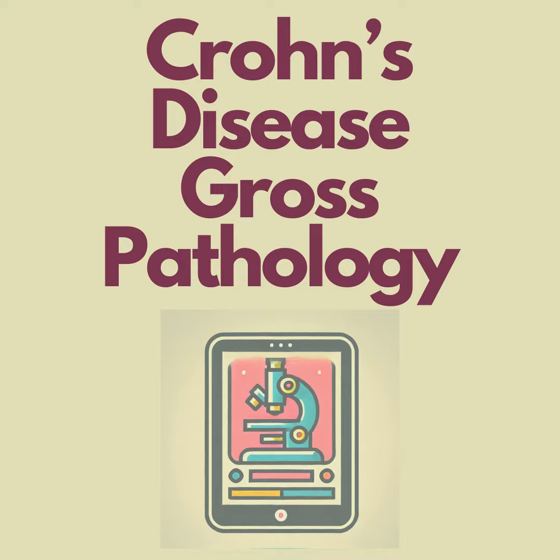Wow. Okay, well, let's talk about how a pathologist would approach grossing a specimen like this. I know there are a lot of different things to consider. What are some of the key steps? So the first thing you want to do is measure the bowel. Okay, so get out your ruler. Yes, exactly. You want to measure the length of the ileum if it's present, the cecum, the ascending colon, the transverse colon, the descending colon, sigmoid colon, and the rectum. Wow, so we're really mapping out the entire territory.